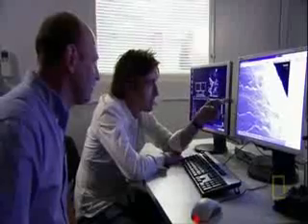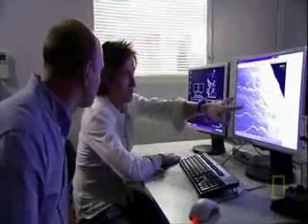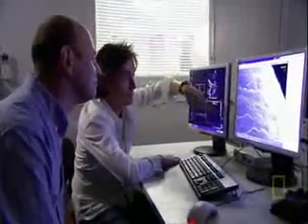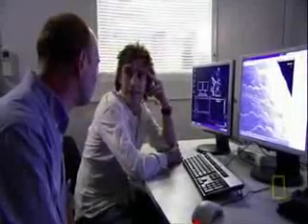This picture has been magnified 5,000 times. The eye in 'Richard' is about 1,000 atoms wide. So it really is working the same way as a sandblaster in there — it's just millions of these things, on a very small scale. It's a lot smaller, yeah. It's a lot fiddlier. Because that's my name — barely noticeable across the width of one hair. One of your hairs.